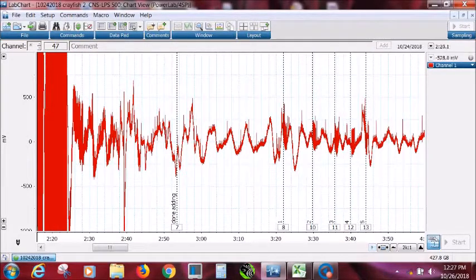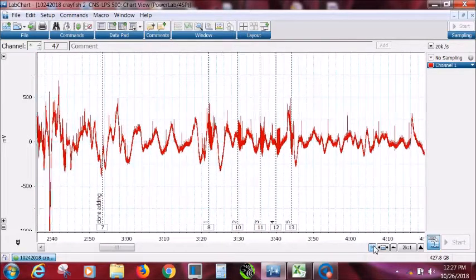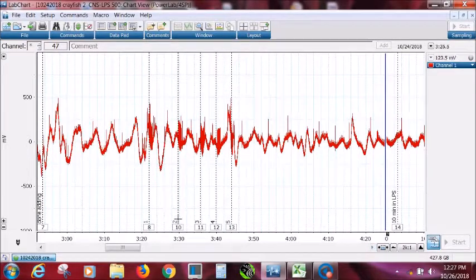And then we might have some kind of noise going on because when we're adding it, there's noise, or it might be stopped and started after we finish the adding. So here we see adding's done, and then we go ahead and do the 5 stimulations again. So 1, 2, 3, 4, 5.